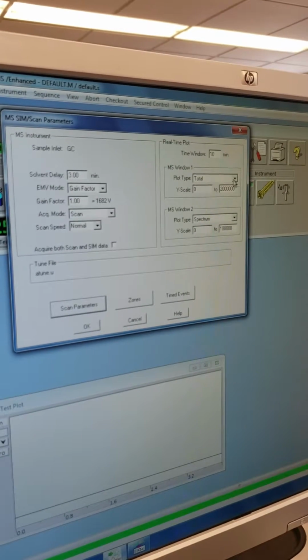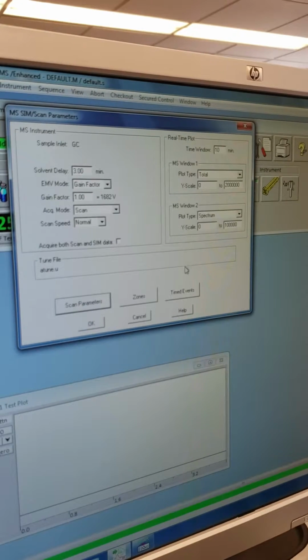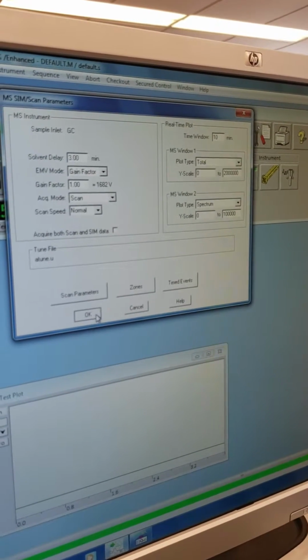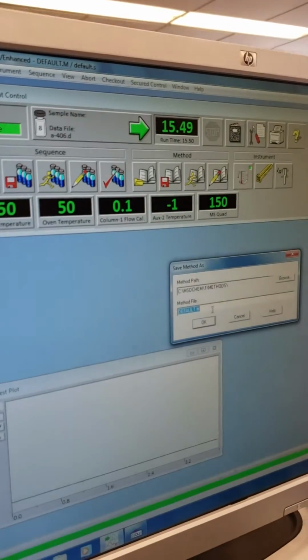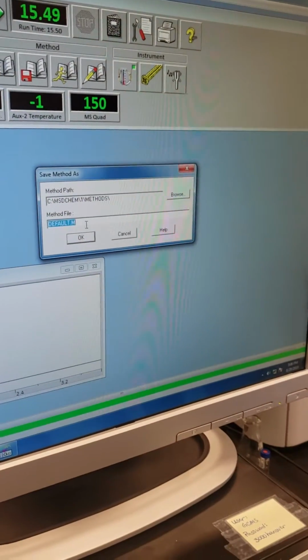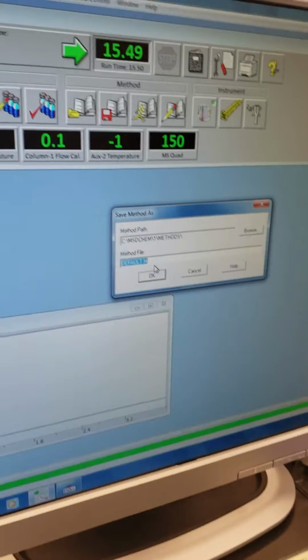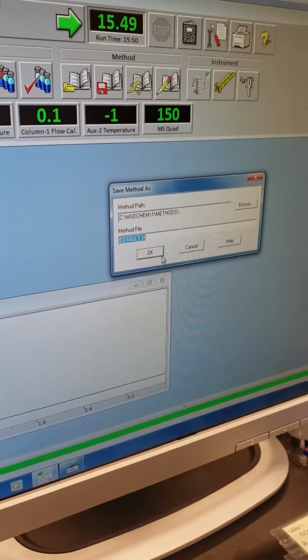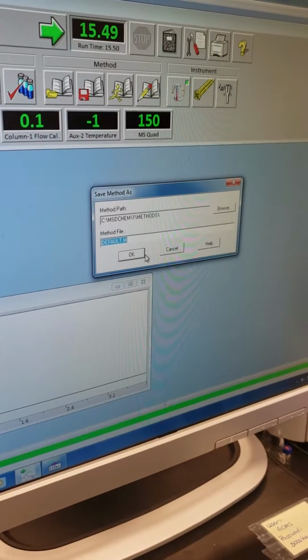These are if you can have it automatically plot. But you don't have to do that unless you want to modify that one. Okay. And here's where, if you alter the default method, you'll need to give it a new name. Something like my method, whatever you want to save it as, and it saves the method name.